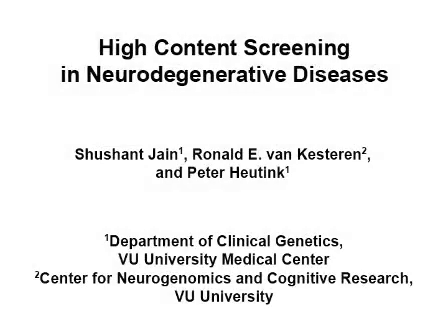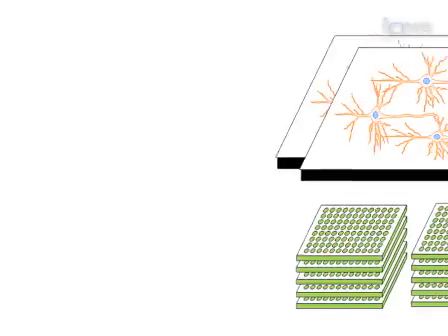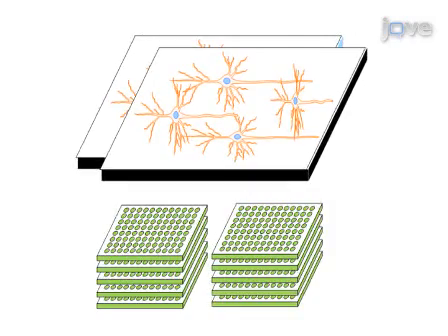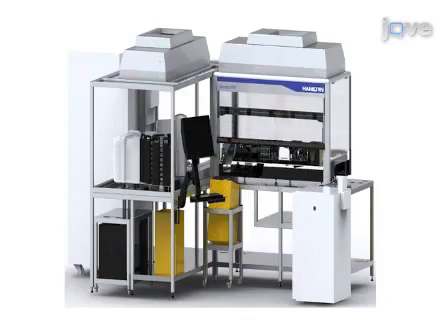The overall goal of the following experiment is to utilize high-content assays in cellular disease models to quantify pathways affected in neurodegenerative diseases. To accomplish this, a cellular model of the disease phenotype is input into the automated cell culture system, and cells are incubated until the required cell number is reached.